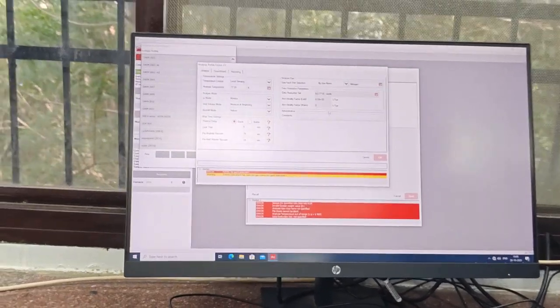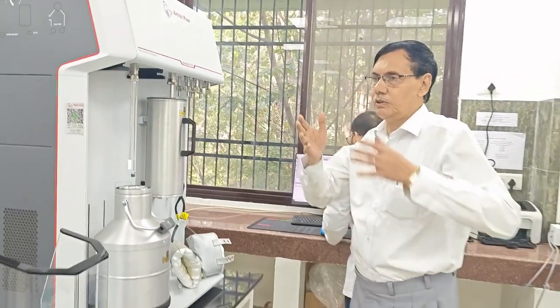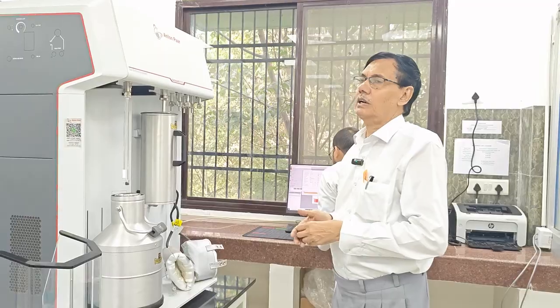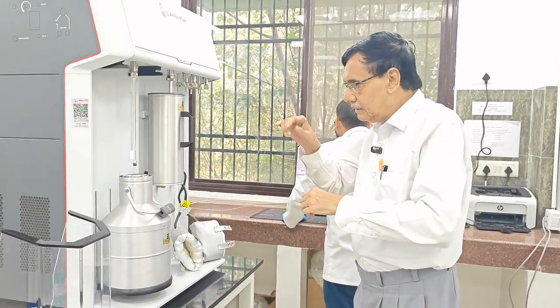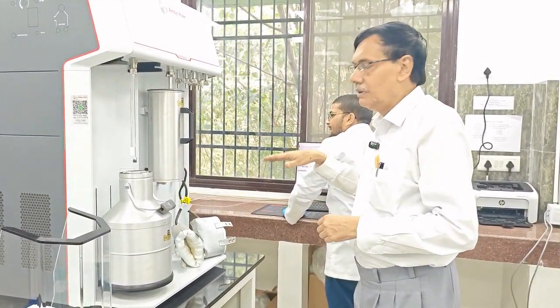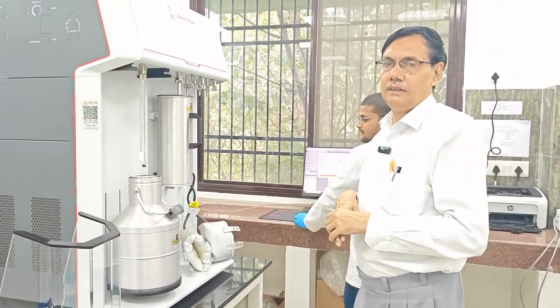And you all know the theory of the BET in my introductory part. I have already discussed the Freundlich adsorption isotherm, then I also discussed the Langmuir adsorption isotherm. And you know that this BET adsorption isotherm is the extension of that Langmuir adsorption isotherm. The only difference is that in that system there is only a monolayer, but here, as we increase the pressure of the nitrogen, there may be multilayer adsorption. That is another thing.